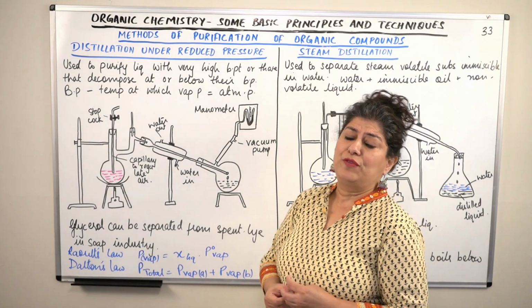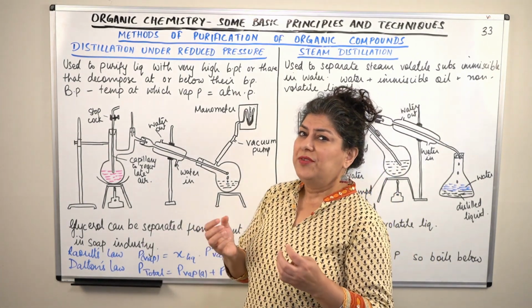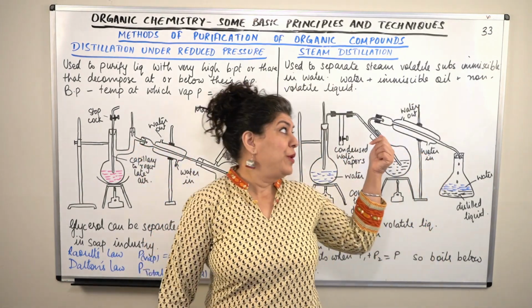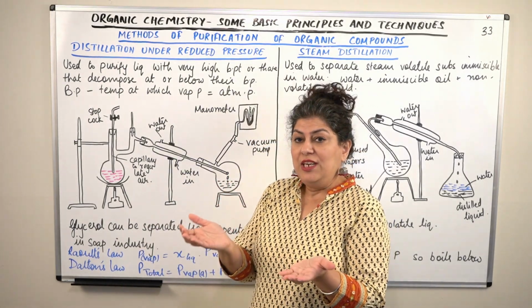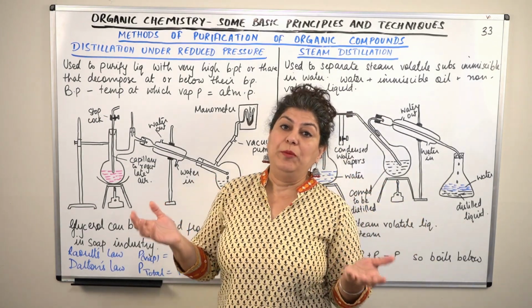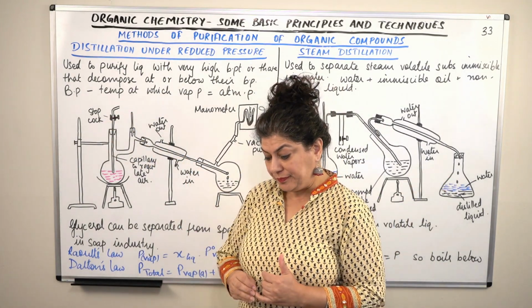And the details of it, why we do fractional distillation, the details and the intricacies of the distillation, I guess you would understand if you watch video number 32. But using that basic information that distillation is based on separating compounds which have different boiling points, let us understand these two distillations too.